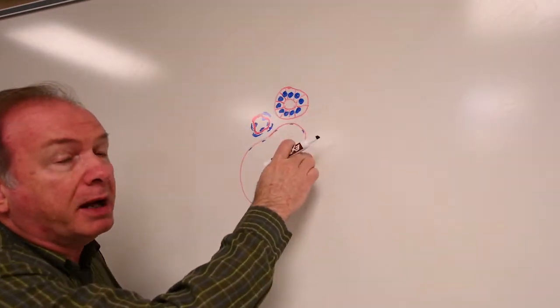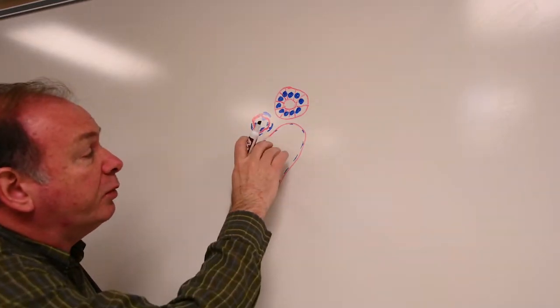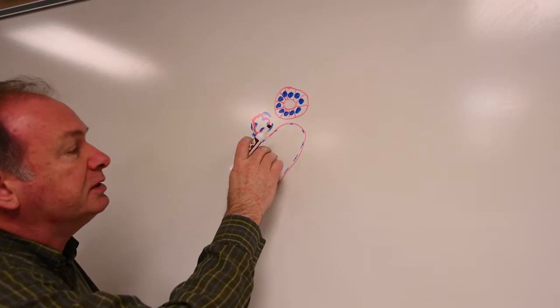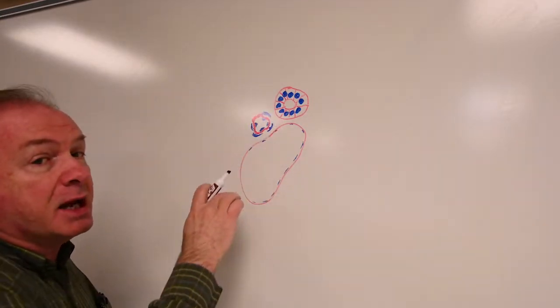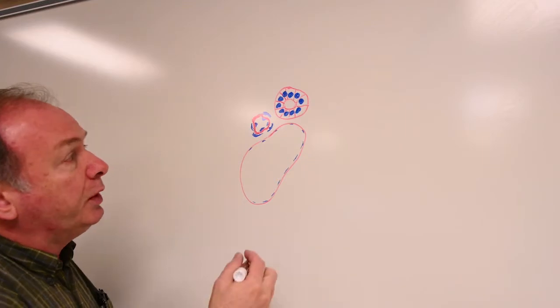Sometimes there'll be 2 or 3 bile ducts associated with a single portal vein branch and artery branch. Sometimes your arteries branch before you get to a next branch of your portal vein, so there could be a couple or 3 arteries and a single portal vein, or the reverse of that. So anyway, the exact number is not that important. It's important that you have all 3 represented to see it as a portal triad.